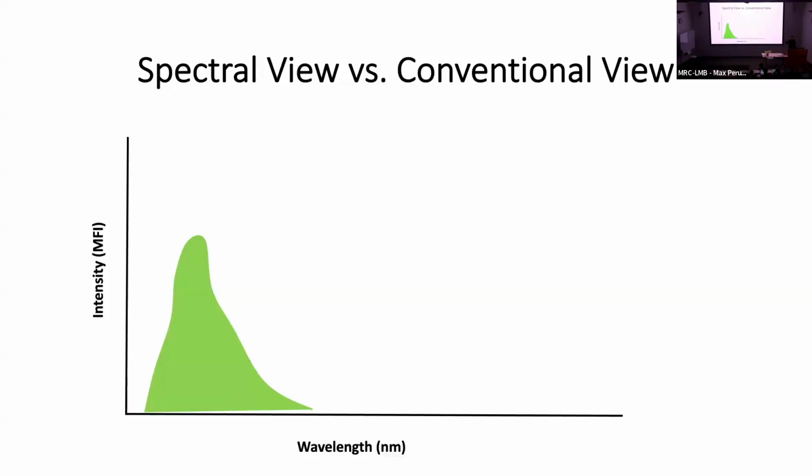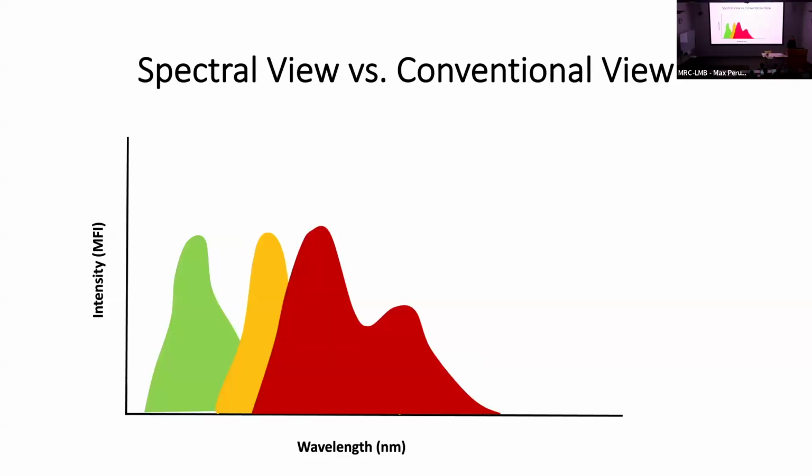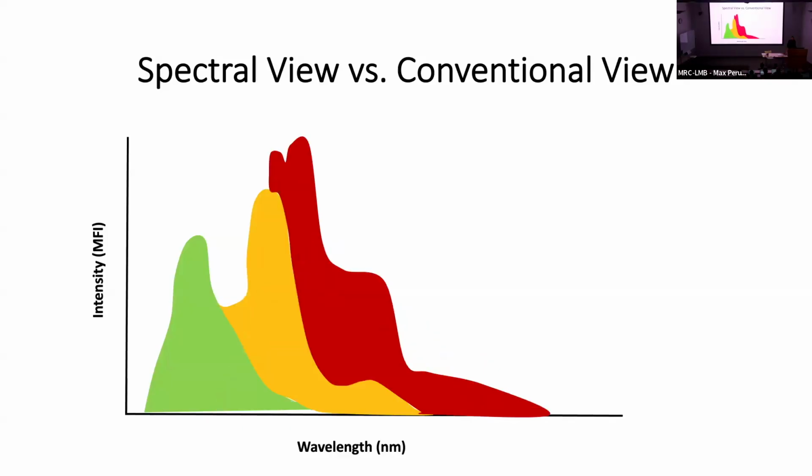That's how it typically looks. And what you would imagine is that if you have two fluorophores here and here, in reality, the way it's actually read is more like this. So there's a summation because of what we call spectral overlap. And then between the red and the rest, you're going to have again a summation of that spectral spill, as we call it, into the other detectors.